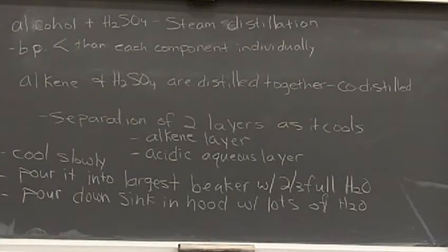It does not go in the organic waste container. Make sure it does not go in the organic waste container. Strong acid and organic waste do not mix, okay? So we do not want it in the organic waste containers, all right?